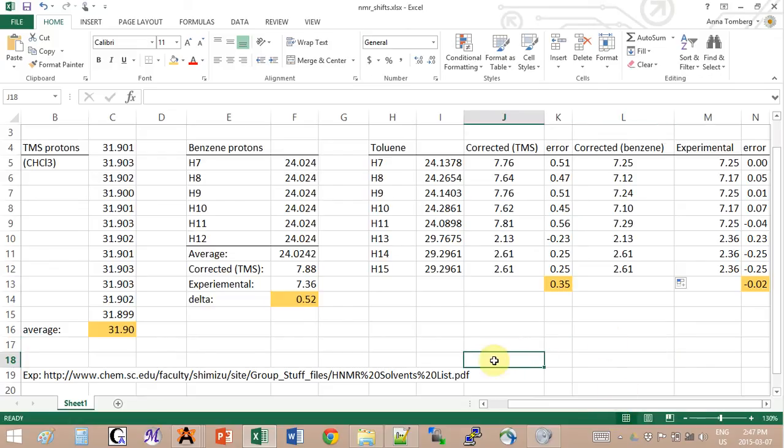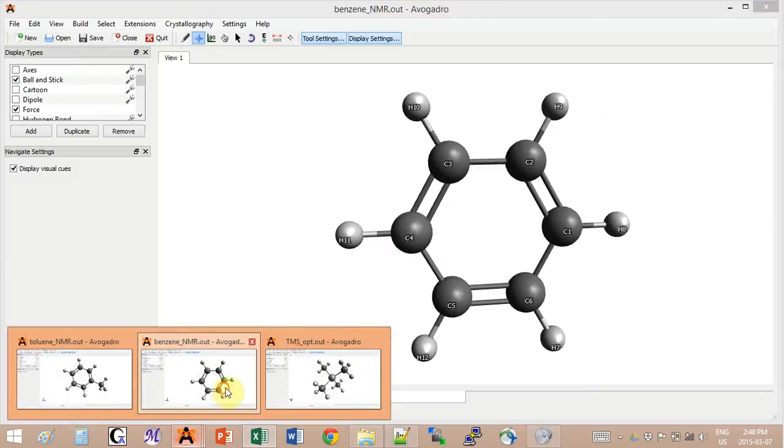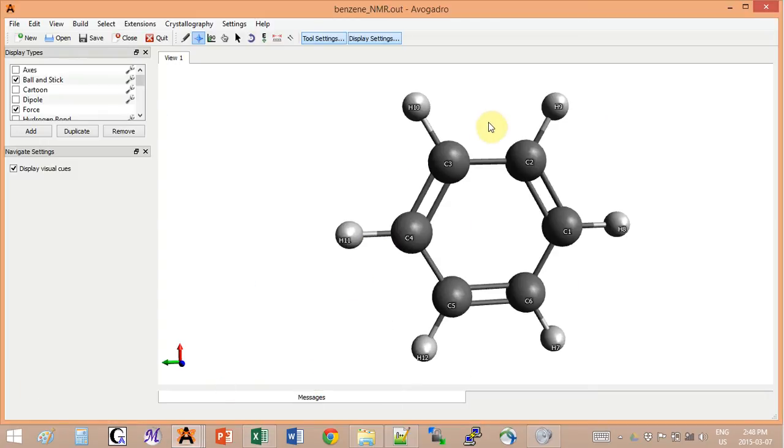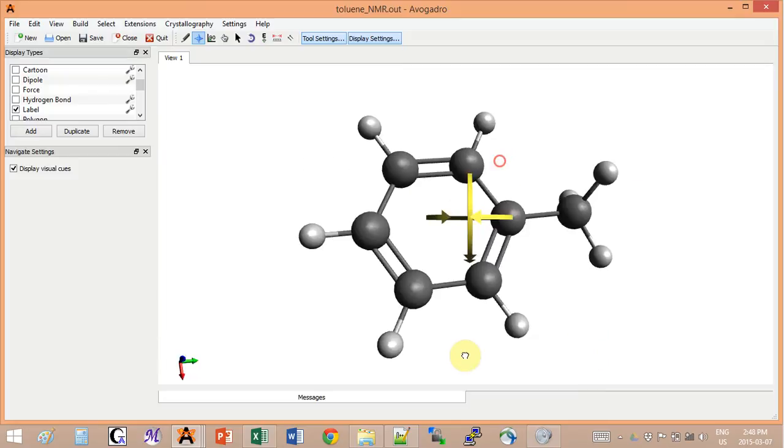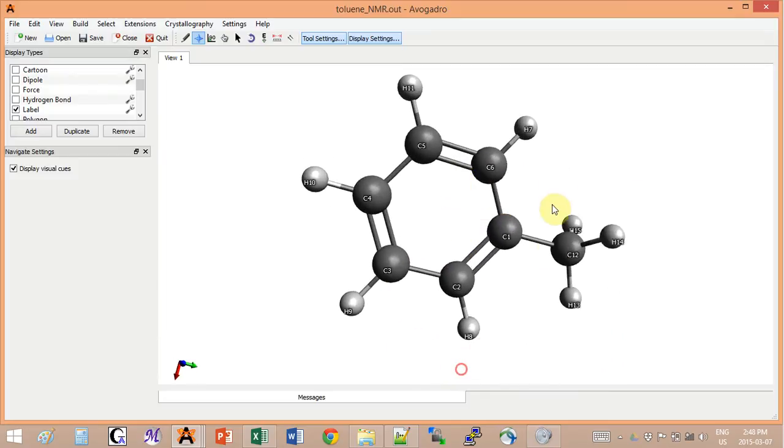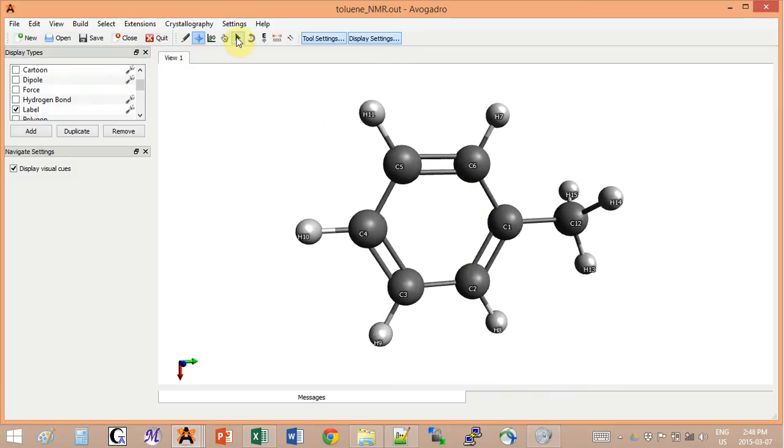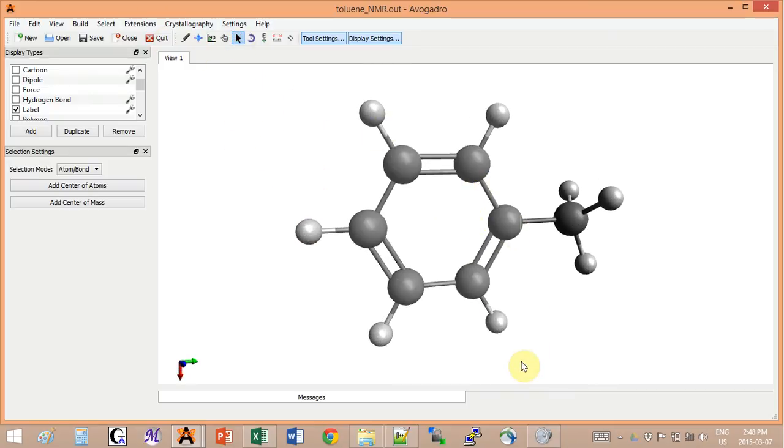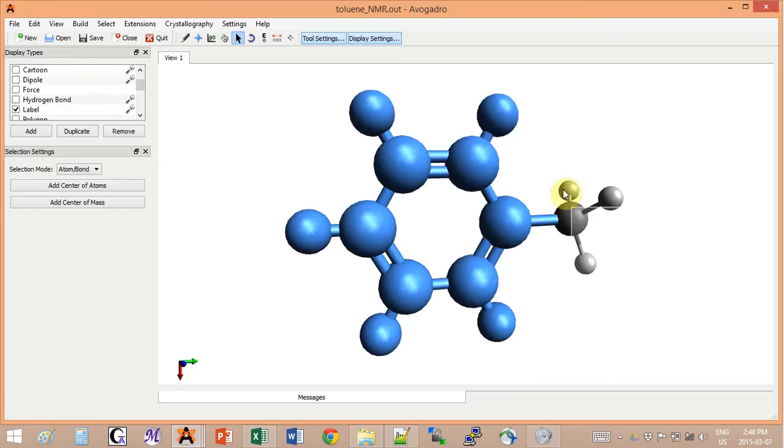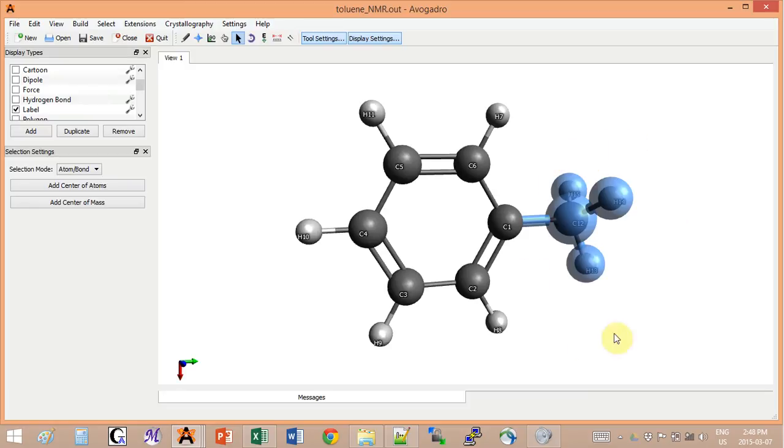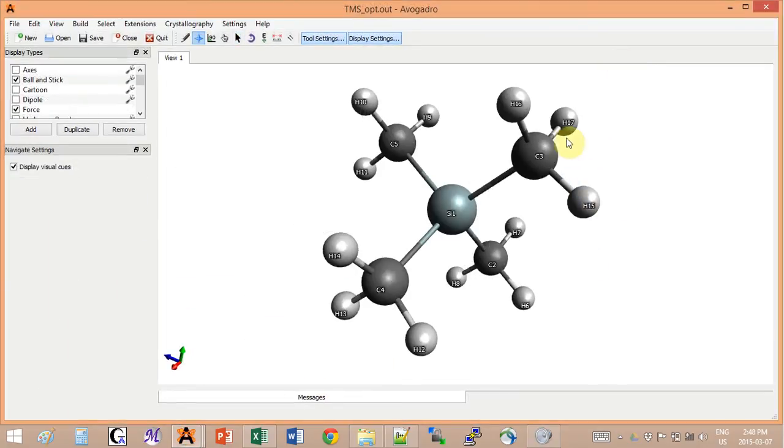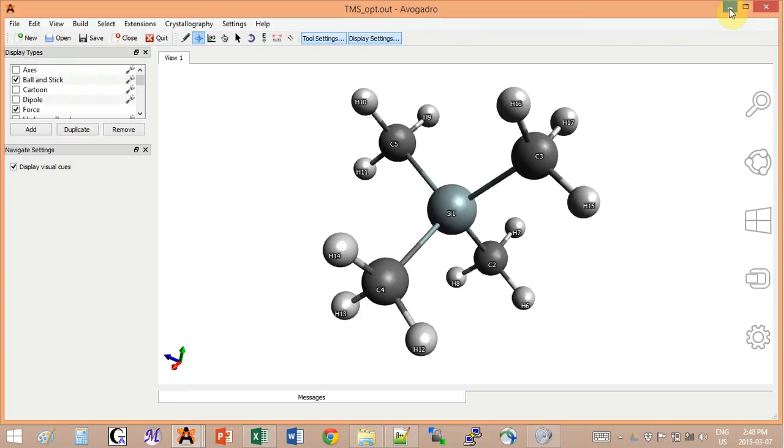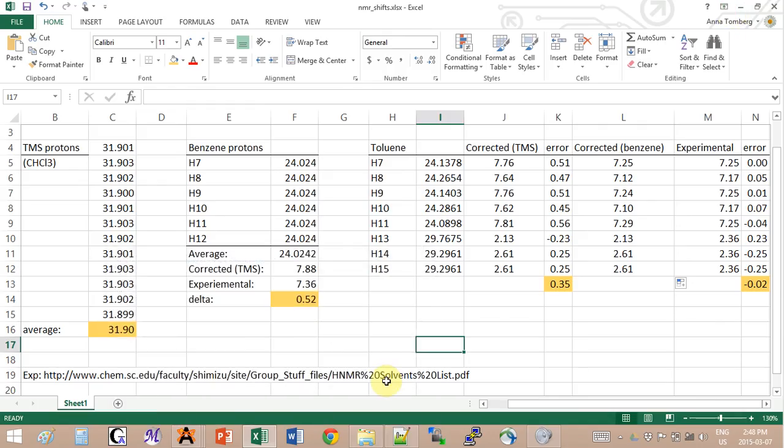So all this to say that just because TMS is a good reference experimentally, it doesn't mean that it's a good reference computationally. What you have to bear in mind is that the closest the molecule that you use as reference is to the molecule that you're actually trying to study, the smaller your error will be. What we did for toluene is that we used the correction for benzene on the protons that are on the benzene ring, but then we did not do that for the protons that are not on the benzene ring, because these methyls look a lot like the methyls over here.